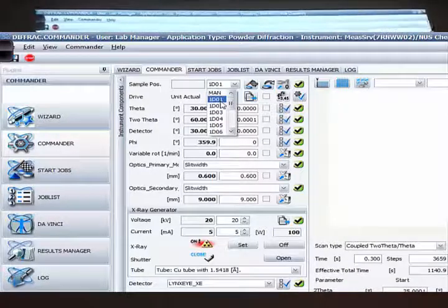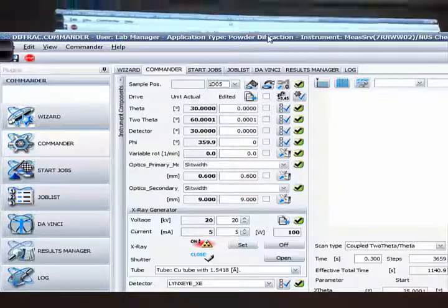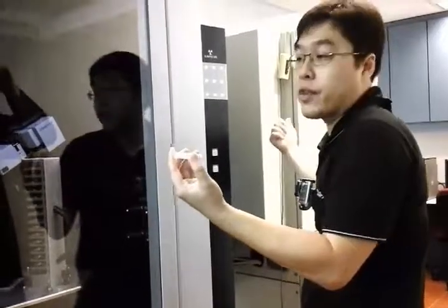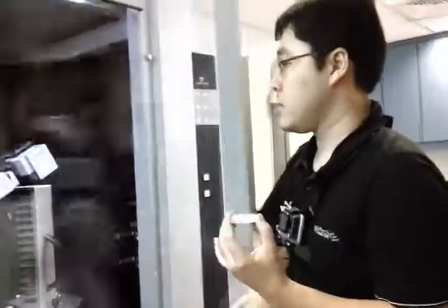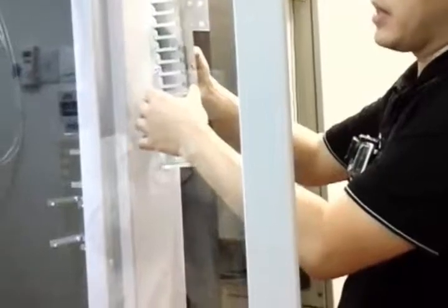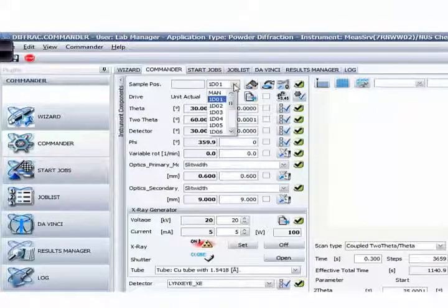For example, let me select D5. For this type of sample holder — a round one — there's no fixed direction as compared to the D5005. Anytime you're done with your sample preparation, you can just load it in. In this case I'll just put it at the position, but make sure it's sitting well so the grabber won't have any issues when grabbing it. Once it's done, you lock it and close the door. I'll go to the Commander and select position 5 and load the sample.